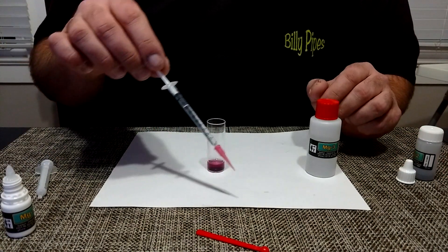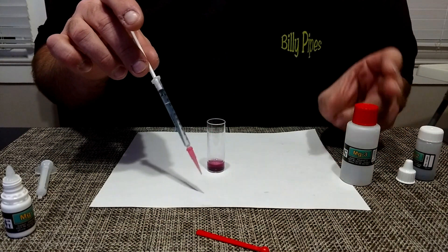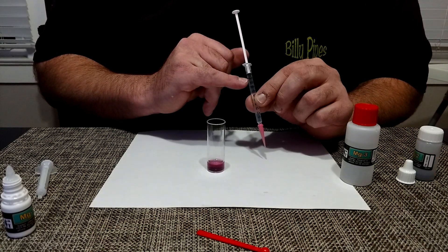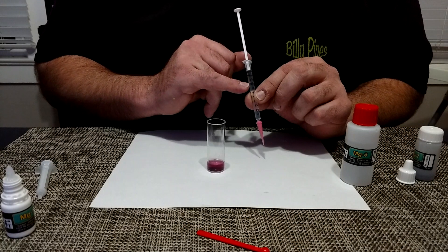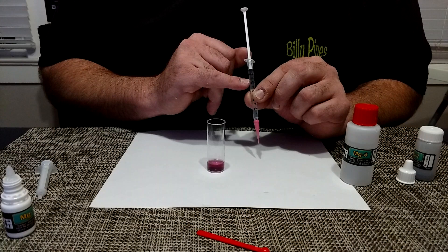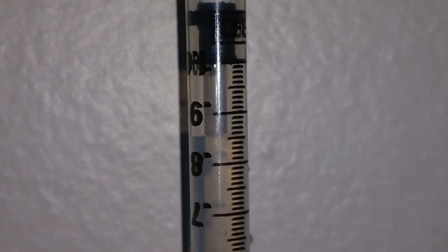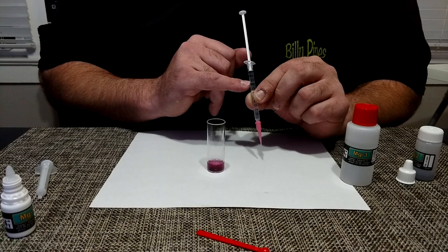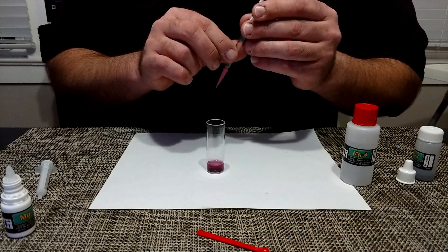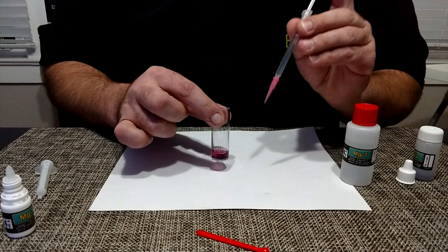Then you want to add one milliliter of the MG3 titration. You want to have an air gap so that your plunger is at the 1.0 mark, and then you have your fluid that starts at the 8.5 — I will show you a picture. Now what you want to do is slowly add it drop by drop while swirling it at the same time. It's going to go from this purple color to a blue color.